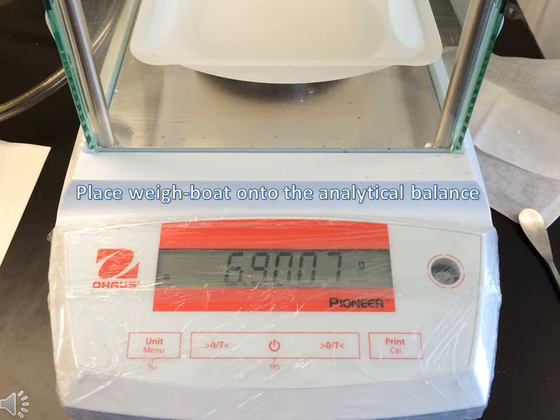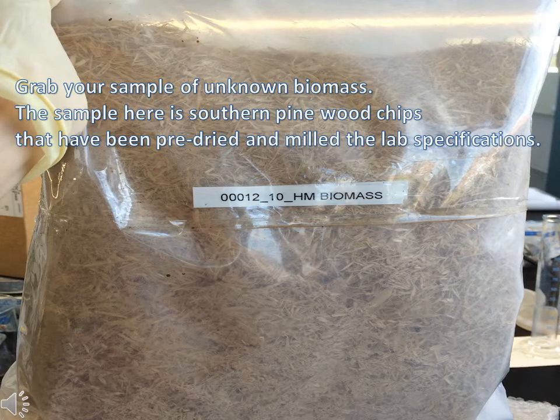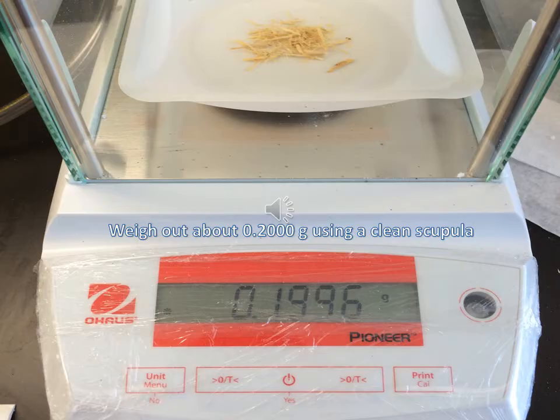Place the weigh boat onto the analytical balance and tare the balance. Grab your sample of unknown biomass that has already been pre-prepared for your lab. Weigh out about 0.2 grams of your unknown biomass onto the analytical balance.